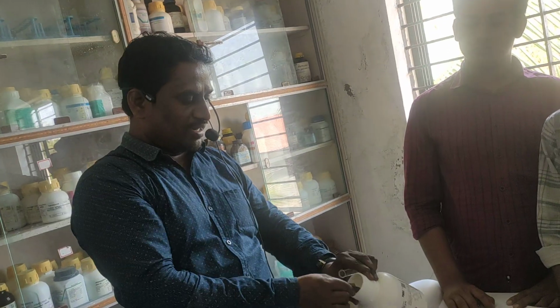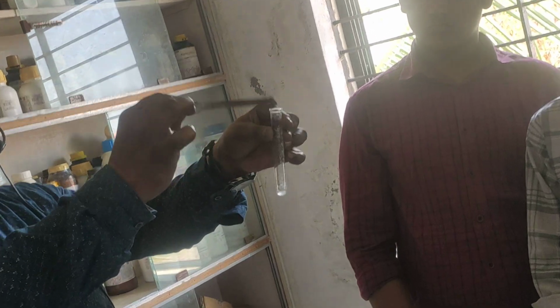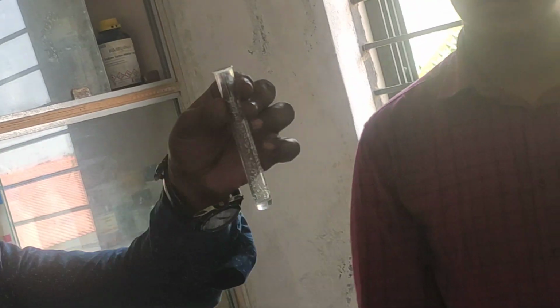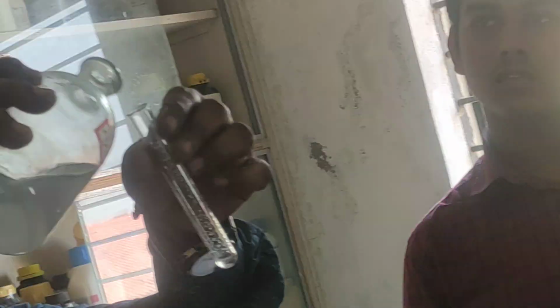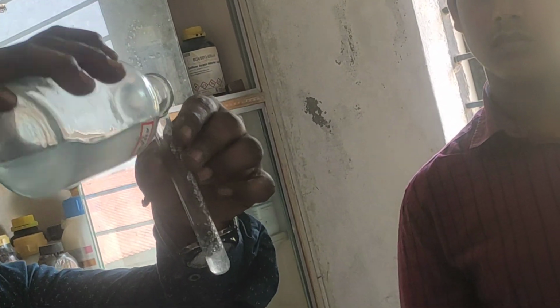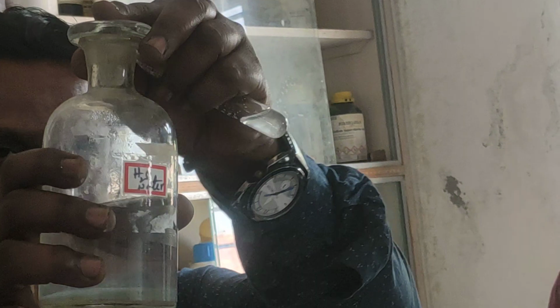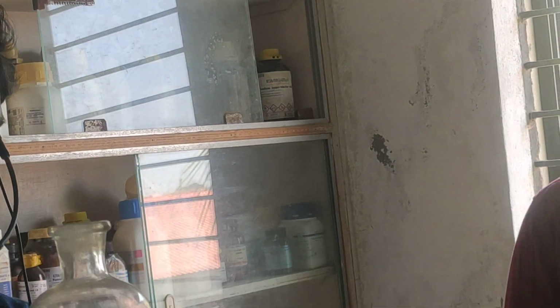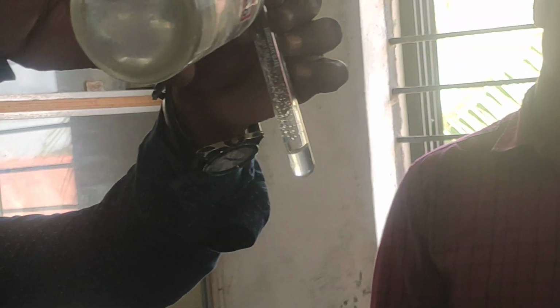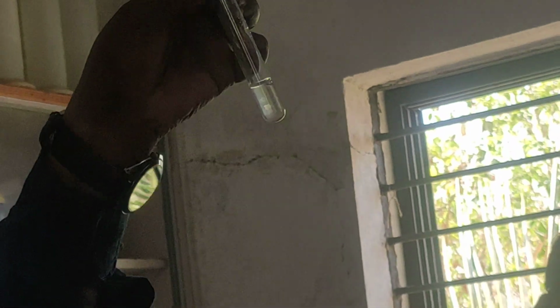I am adding ammonium chloride to the given test tube. Along with this ammonium chloride, I am also adding ammonium hydroxide. Along with this ammonium hydroxide, I am adding H2S water. You can observe here, I am adding H2S water. Observe carefully. There is no precipitate.